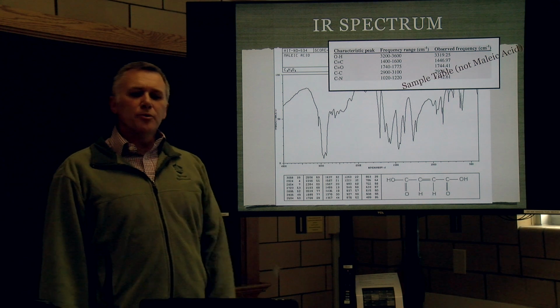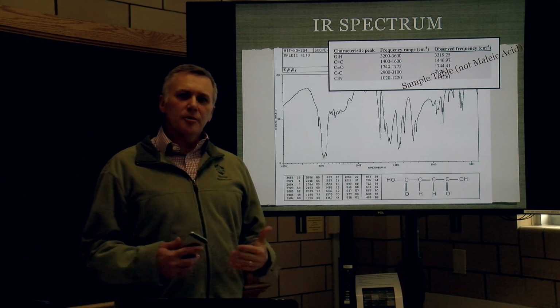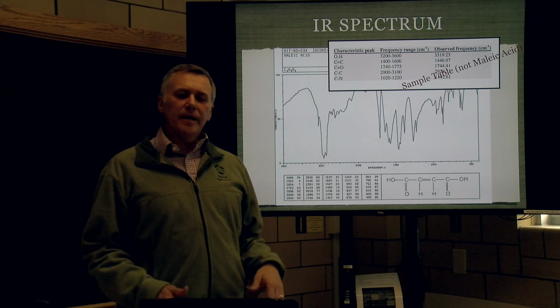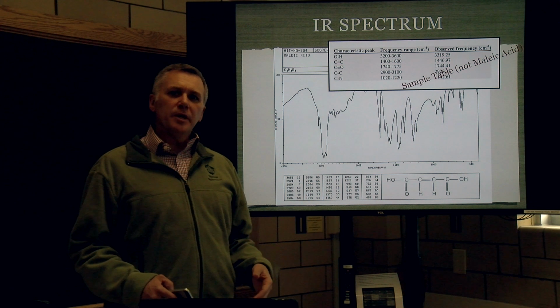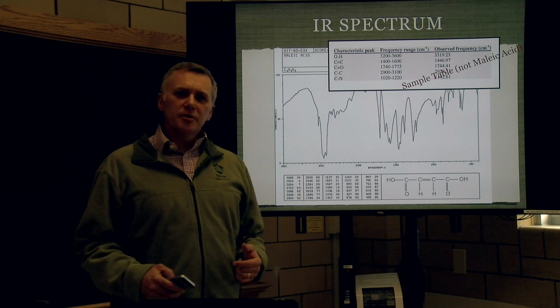All right, so as we go through the experiment, one of the things I want you to do is be thinking about some observations, thinking about the procedure, noticing various things along the way, and making sure that you're recording data. We're going to try to make that obvious with the camera so that you can get values for mass or melting point, whatever it would be. All right, and so we'll do that. And so let's get ready to do the experiment.